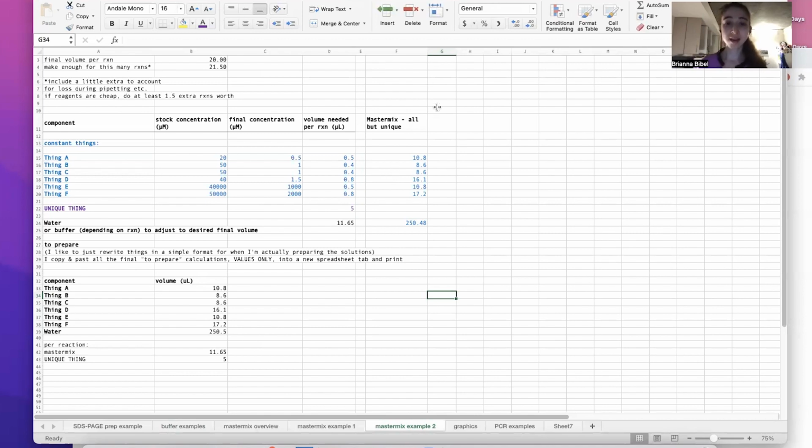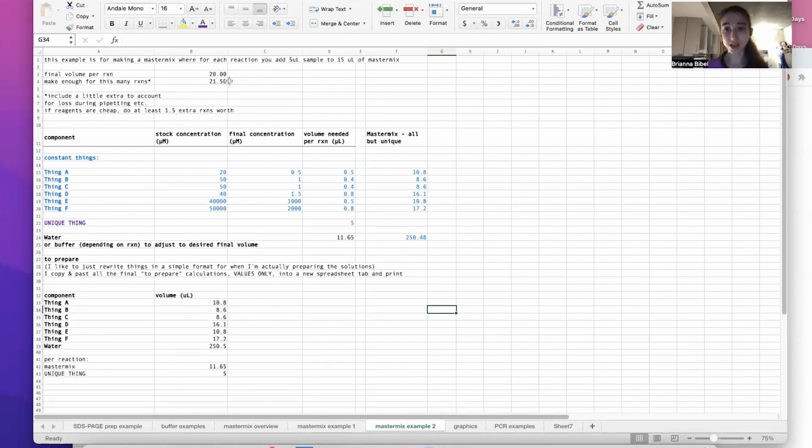And the pipetting is also going to be more accurate, so it's helpful for the master mix in that sense as well. Then you won't have as much variability in the amounts between the different samples. But speaking back to pipetting, remember that's part of the reason why we make extra volume.